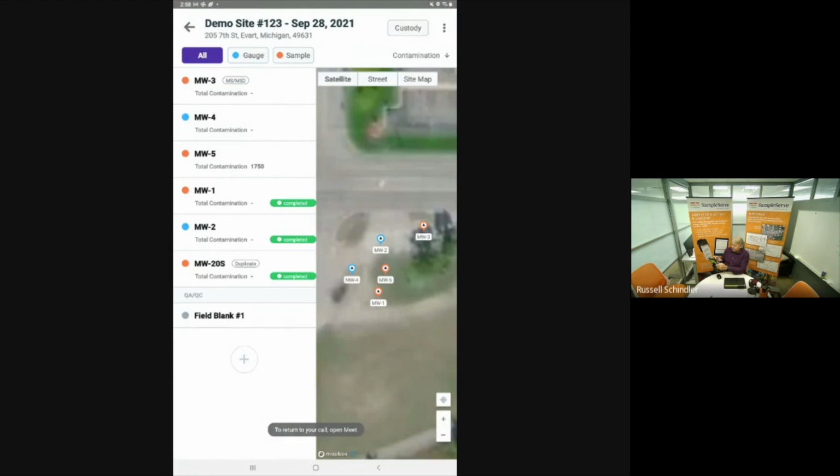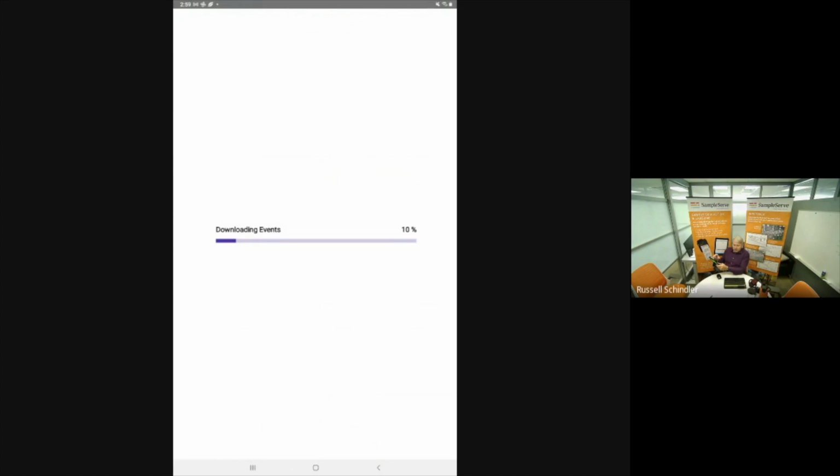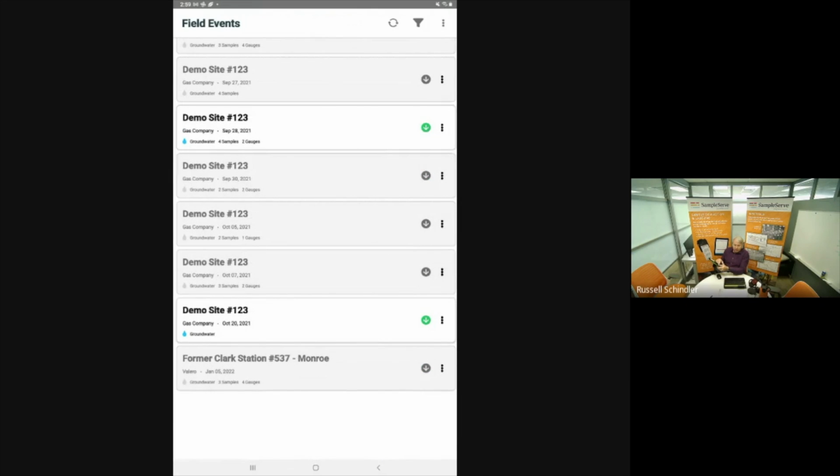On the main screen here, this is like the home screen. You'll see I don't see October 7th yet. So I'm going to come up here to the top, hit refresh, and it's going to download the most latest events. You can see now there'll be October 7th. As I just created it, I had not refreshed my screen yet. And you can see there's one that's already green, and then the others are gray.